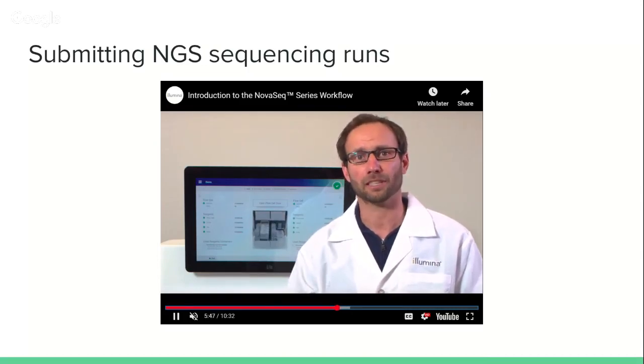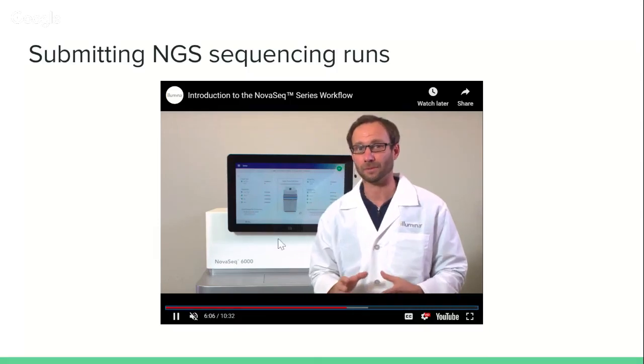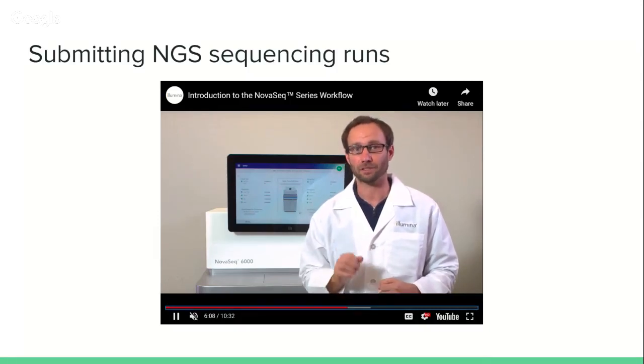The GridION with 5 different flow cells, the PromethION with 24 or 48 different flow cells that can be fed into the system at different times. So you can do a much smaller buffering of samples into sequencing. And remember, all this needs some library prep from the previous slide, so you have to account for that as well.